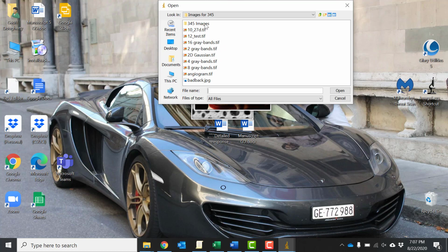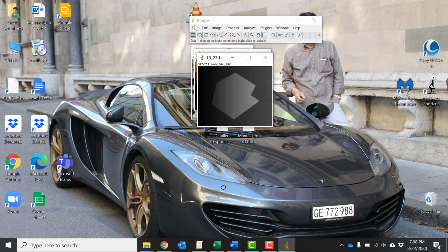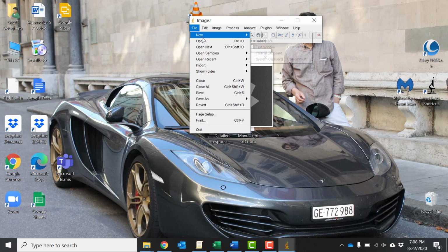And you want to open Canvas, get into Files, click on the 3 dots on the right-hand side and download these images and more of them into a directory called Images for 345 so that we can get access to all of these images when we want them.